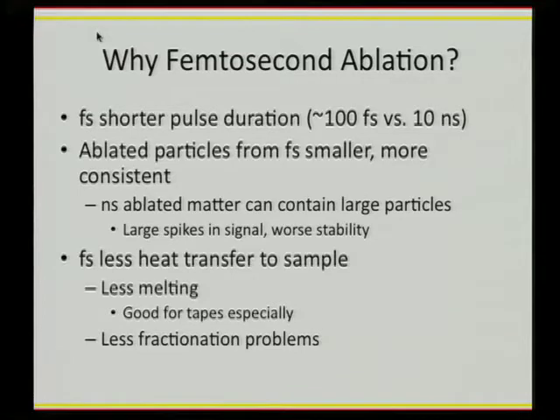Nanosecond ablated material can lead to large particles that are not readily ionized in the plasma. You can get large spikes, and then your signal is off and your RSDs are off, and you have worse statistics.